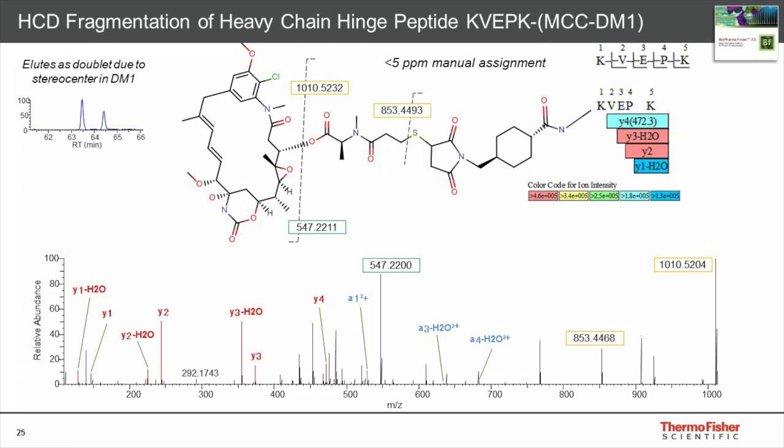In this case, what we've done is we've allowed the software to identify all the peptide-related peaks. And looking at the raw data, and from the literature, we found that there are several peaks which are signature peaks for either the glycopeptide, or the conjugated drug linker peptide fragments, or in this case, just signature ions that would be specific to the linker drug itself.